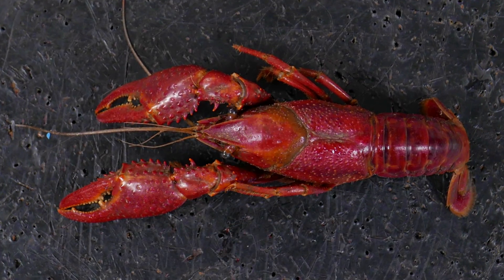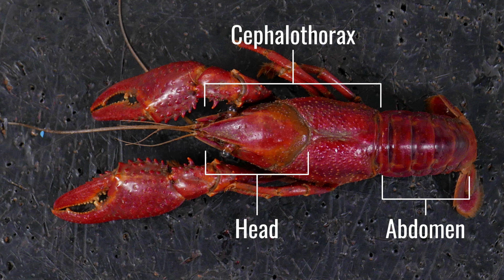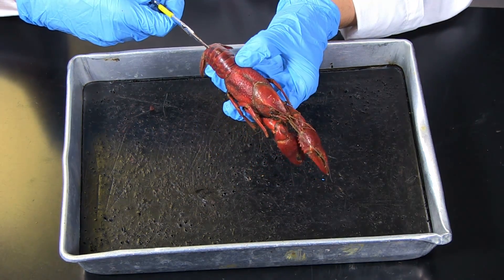Observe the external anatomy of your crayfish. Locate the head, cephalothorax, and abdomen. Observe the carapace, and then the ventral surface of the crayfish as directed in the learning unit instructions.